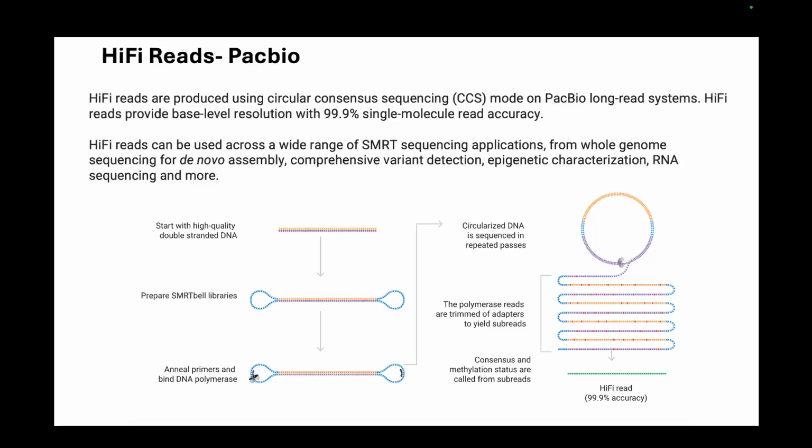Just keep in mind, this is a technology that improves your read quality. Sequencing, or synthesizing these DNA strands, is not a perfect process.